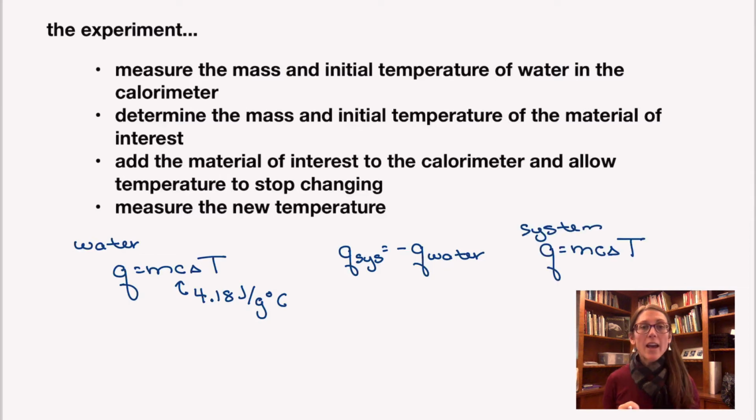just like you did in lab. And so as a result, we have a very simple experiment. We're just putting something in water, and yet we're able to measure the amount of heat change of that material, as well as information about that material like specific heat capacity or perhaps mass if that's what we didn't know. For a really simple experiment, we can actually get a lot of really useful information for things that are hard to measure directly, and that's the beauty of calorimetry.